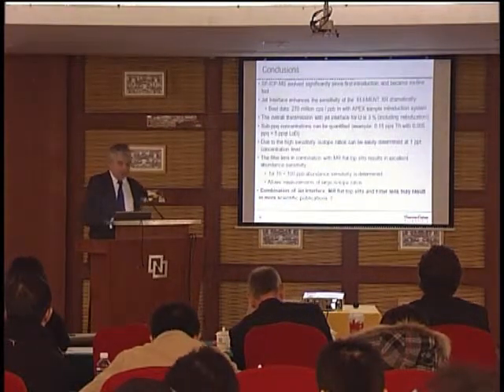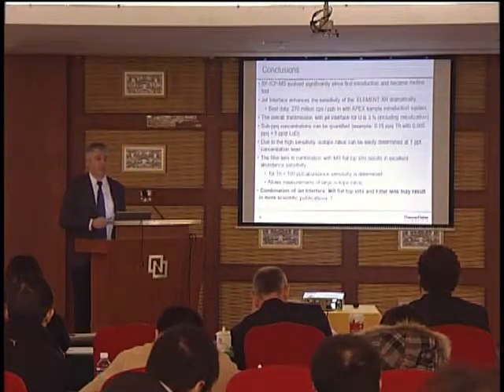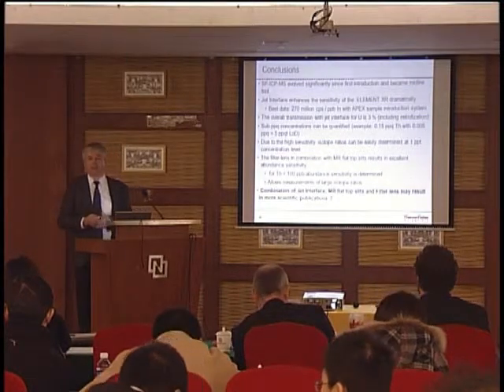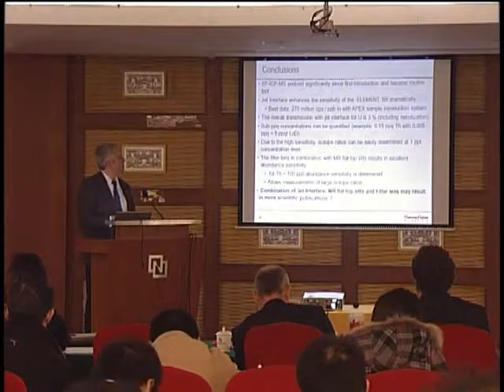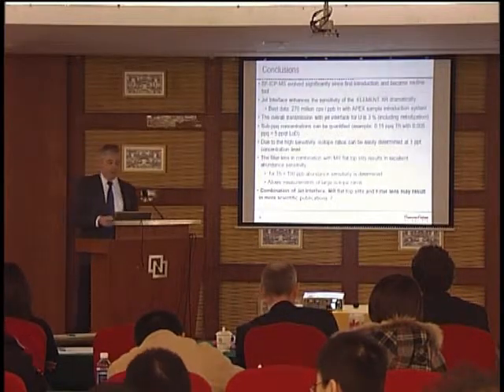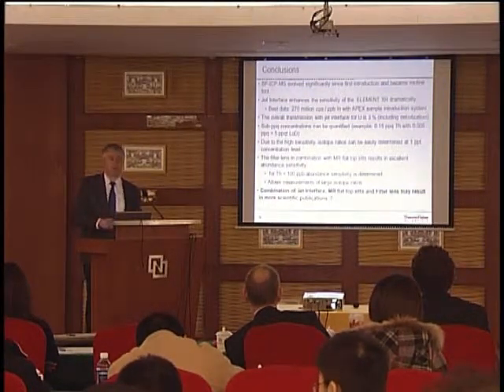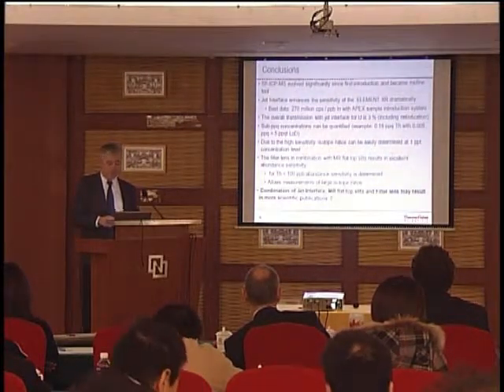So to conclude, I think sector field ICP-MS evolved significantly since the first introduction, and just comparing the numbers, 20,000 counts per second then, and now 270 million counts per second per ppb, I think clearly demonstrates this, and this is what we achieved with the new interface. And with the new interface we also calculated the overall transmission for uranium. It's not at the 10% of the TIMS, but coming very close, and it's 3%. And this is including the ionization.